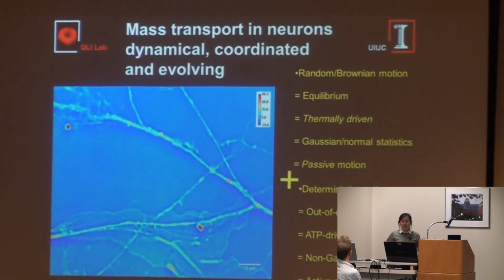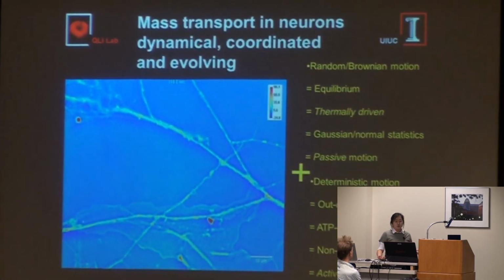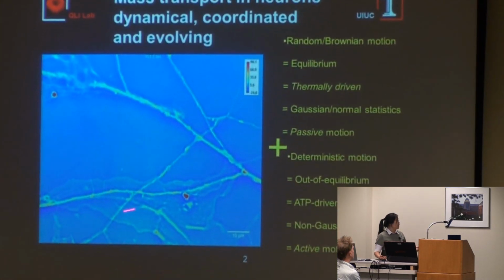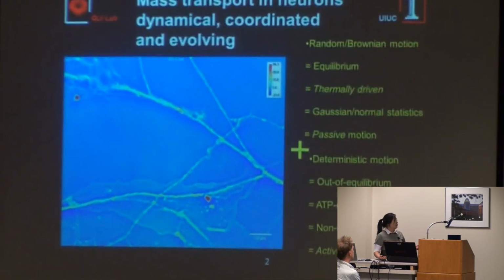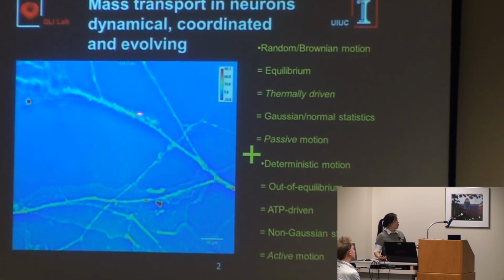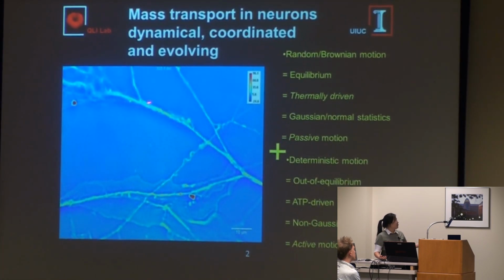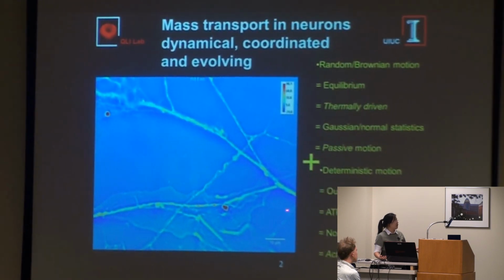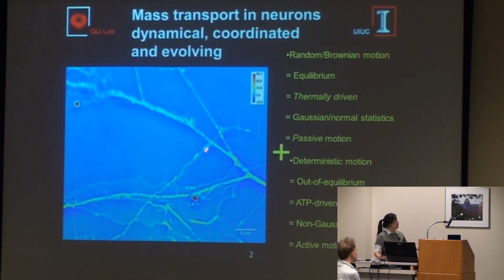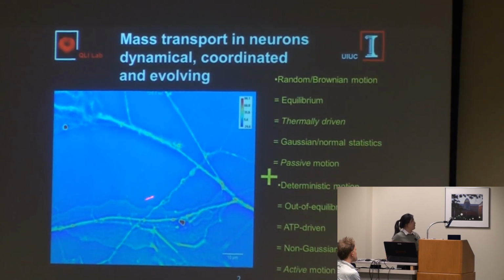So at the beginning, I would like to show you this movie so you get a feeling for what kind of questions we are addressing. This is the live imaging of neuron cells. We can see there is a lot of dynamics happening here, and it's quite complex. For example, these vesicles here are busy traveling back and forth on these highways, and the membrane keeps fluctuating, and the microtubule is buckling and the filopodia is doing a bending motion. So this is quite a complex system.